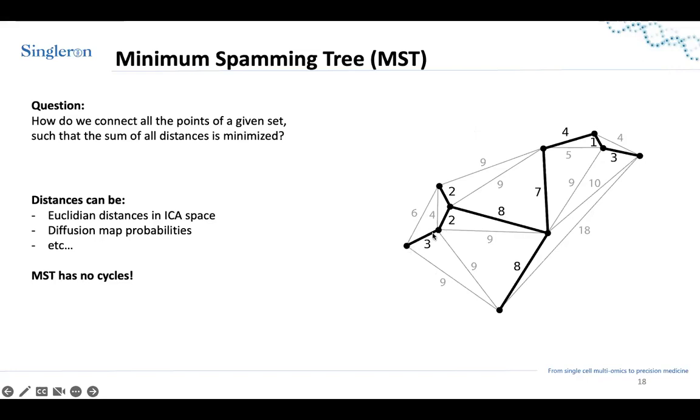each pair of cells, like this one and this one is 3, this one and this one is 6. The exact meaning of the distance doesn't mean anything actually. It's just to see that these two cells are closer than these two cells. Okay, it's just a value to see which cells are closer and which are not.